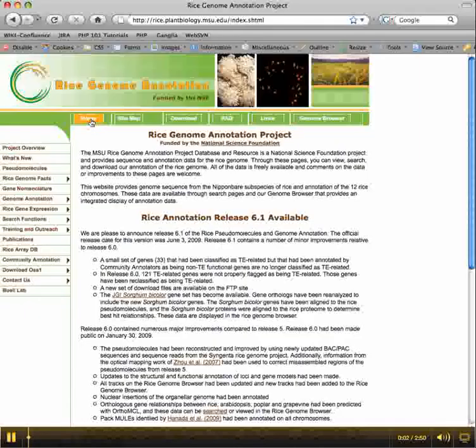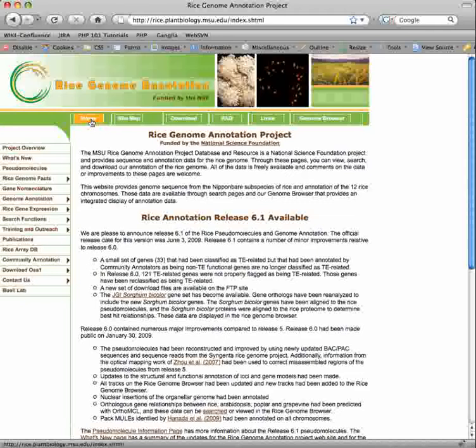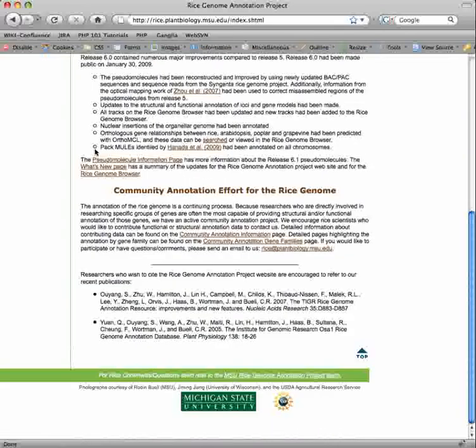Welcome to the MSU Rice Genome Annotation Resource. On the homepage, we provide a description of the salient features of our most recent release, with links to additional pages on our annotation methods and data. We also support community annotation of the rice genome. Here's a description of the project and how you can contribute your annotation to the MSU Rice Annotation Project.